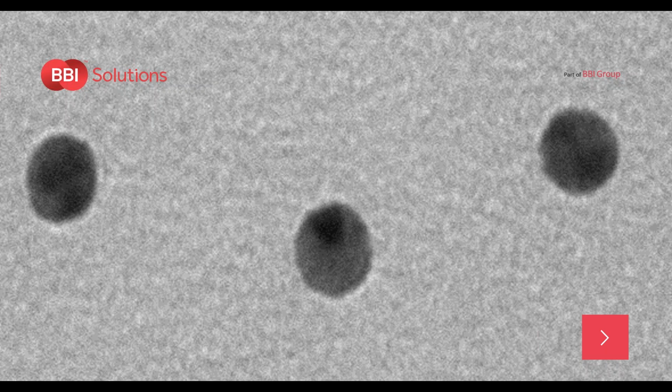The particles are formed by the citrate reduction of a gold chloride solution, and this means that the gold nanoparticles nucleate out of solution and they grow as a crystal. So rather than growing as a true sphere, we have a crystalline structure, and this means we can see the facets on the nanoparticles. It's important to remember that although the particles are referred to as being spherical, we should really use the term isotropic with regards to particle shape. But because they grow as crystals, they're not going to be a true sphere. They will have these facets to them.